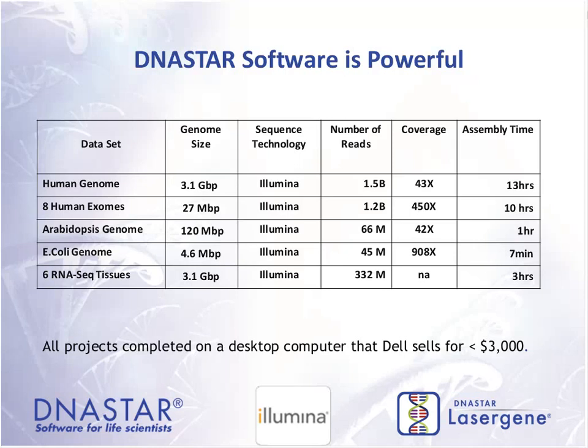Smaller projects like human exomes may take a little over an hour each to complete. We can multiplex these projects into single assemblies. So we have our second benchmark, which is actually a project that we'll look at today. It's 8 human exomes aligned together to the human genome, very deep coverage, approaching 500x, and that's about a 10-hour assembly.